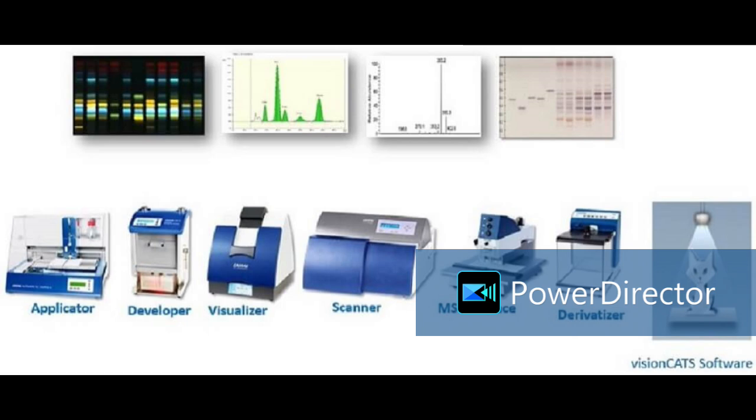Here, 1, 2, 3, 4, 5 different standards are applied along with many other samples at the same time. We can analyze qualitatively, meaning whether a compound is detected in any sample at that particular Rf value, and if it is detected, we can quantify how much it is, because of proper resolution and proper bands. So qualitative and quantitative analysis is possible.